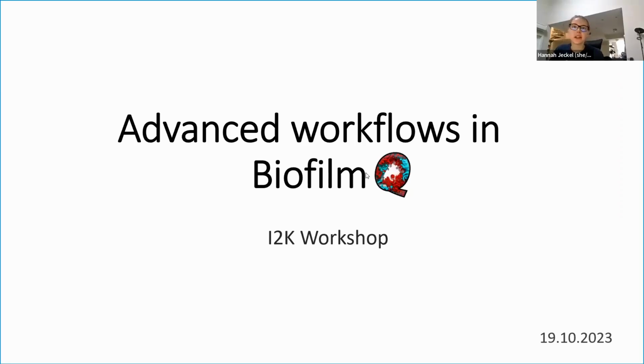I'm really happy that you're joining me here today for an advanced workshop of BiofilmQ. So I'll go ahead and give a brief overview of, I don't know which screen you're seeing right now. You should see, do you see a presentation? Yes, you see a presentation. That's great. I want to start by giving you a brief overview of what we're going to look at today.